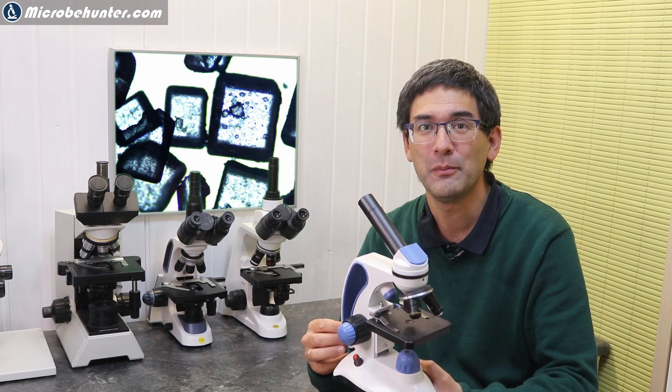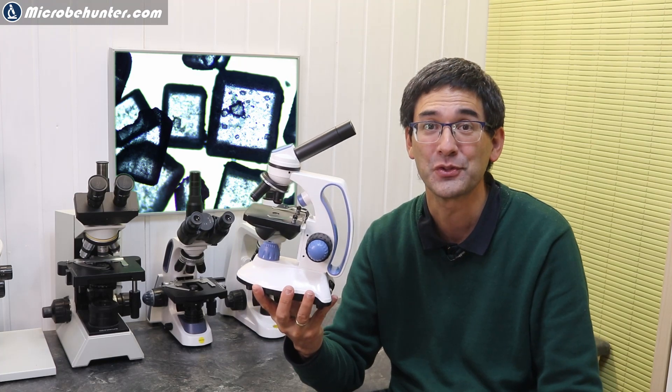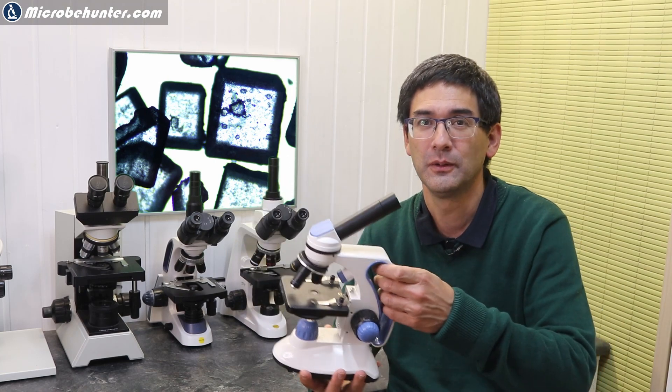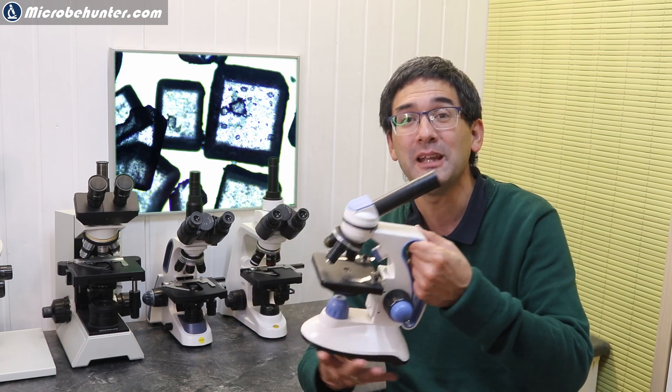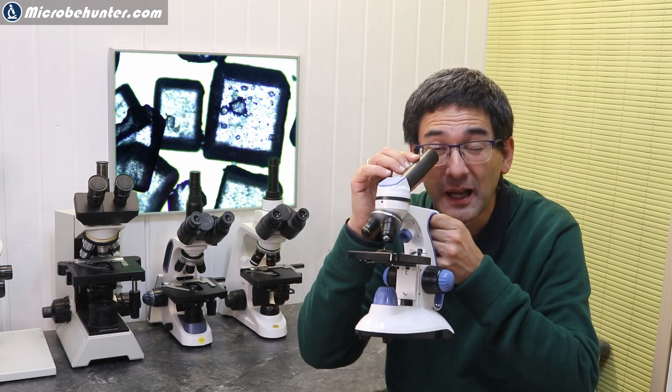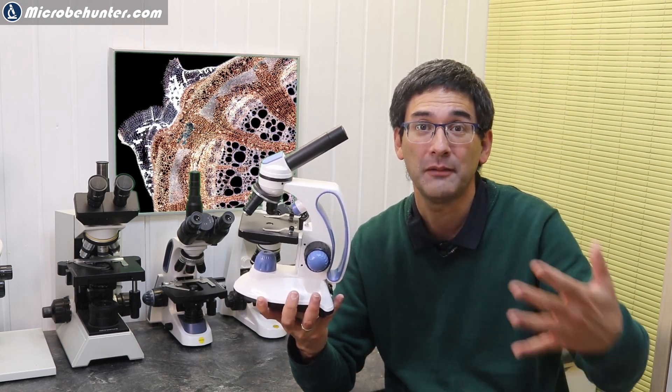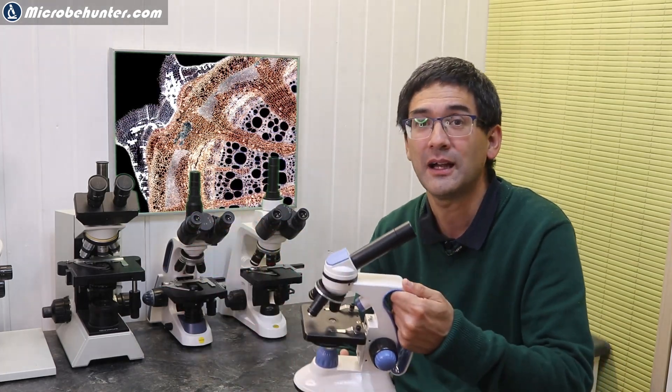So that's it. Again, I hope that the video was informative for you. Some of you might be a little bit surprised that I'm placing such a strong emphasis on those small, low cost introductory microscopes. Because many amateur microscopists think that you have to get good quality devices. Well, first of all, it's a good and a quality device. But of course, certain limitations have to be made. For example, there's only one eyepiece to look through. There is no condenser. There is no mechanical stage. Small microscopes on this price range have to be a little bit simpler in design than those large ones that you have standing over here. It's an entirely different category. You have to take those microscopes for what they are.